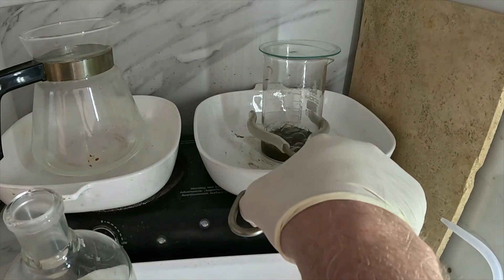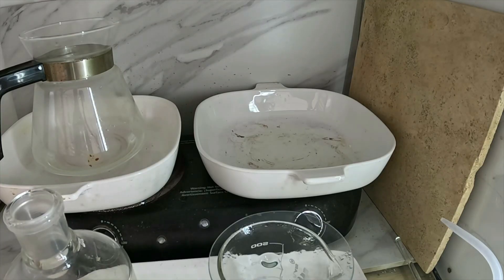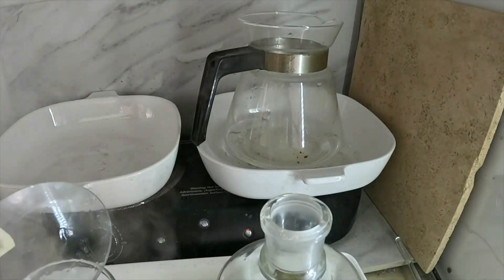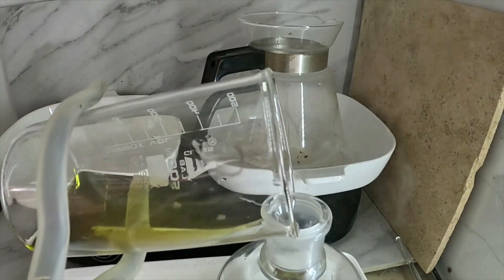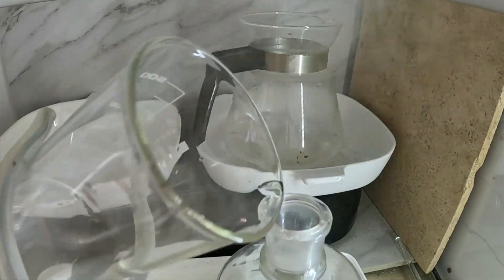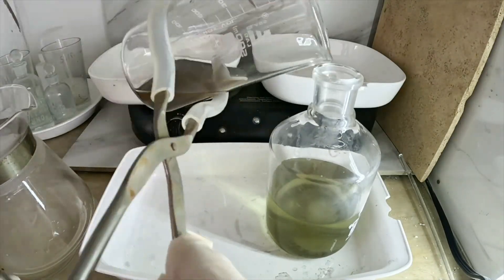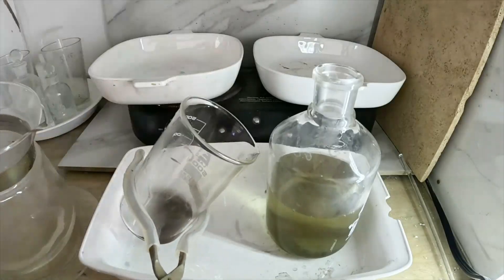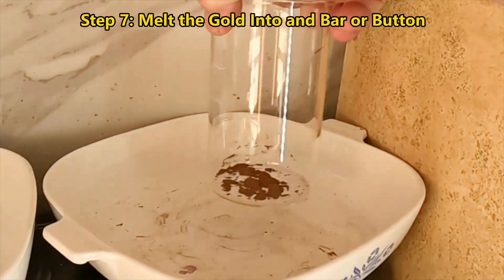It's been boiling for about 10 minutes. I'll pull it off the heat, decant off the acid, and then do several washes with hot distilled water. Then we're going to carefully let our gold powder dry before melting. Here's our dried gold powder — I'm going to take it over to the melt station and get every last bit of it into the melt dish.